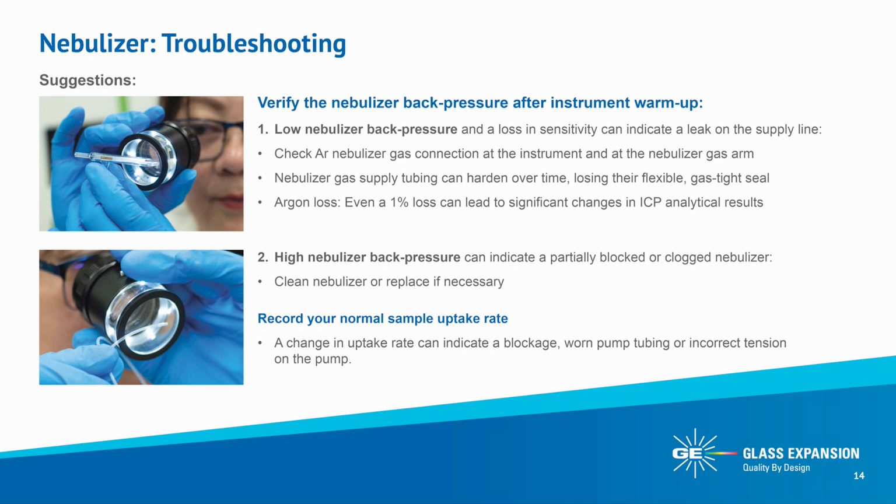It's also helpful to track your normal sample uptake rate to ensure it stays consistent. A drop in the uptake rate can be another sign of a blocked nebulizer. Also, make sure to regularly inspect and replace the pump tubing.